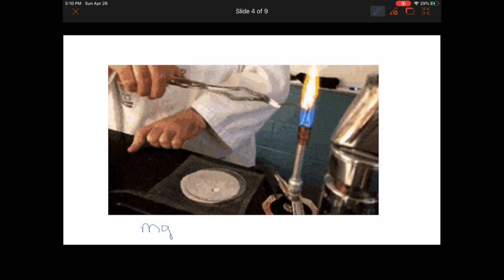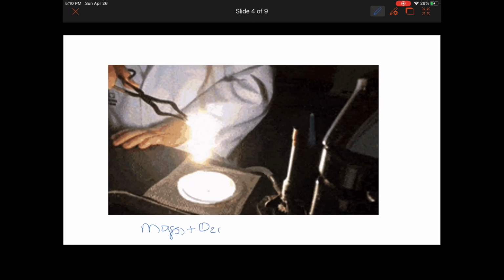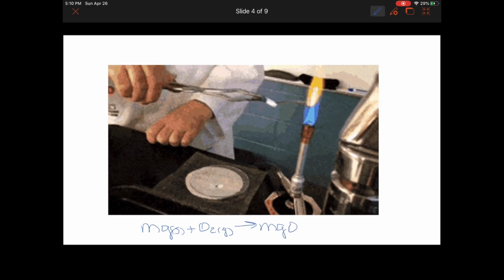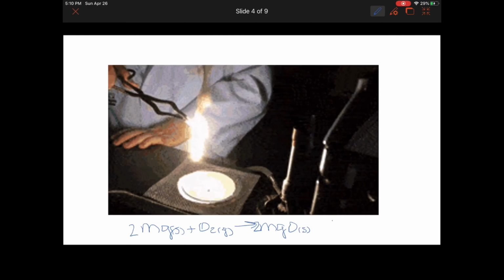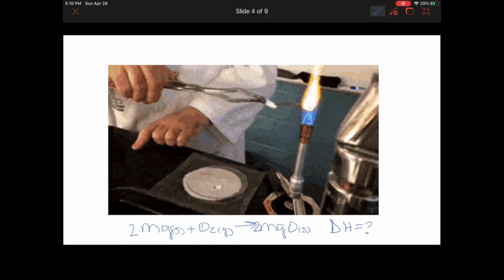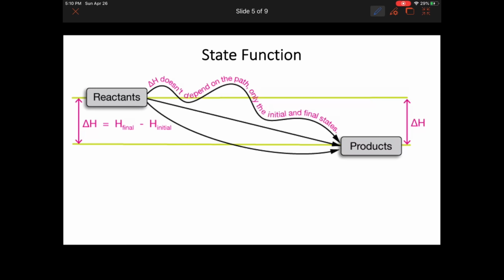The burning of magnesium ribbon demonstrates the combustion of magnesium, and a great deal of light energy is released from this reaction. Because this reaction is highly exothermic, it would be difficult to directly determine the amount of heat associated with this reaction. However, we can use an indirect method of measuring the heat that is produced.